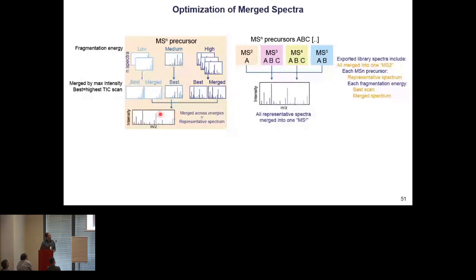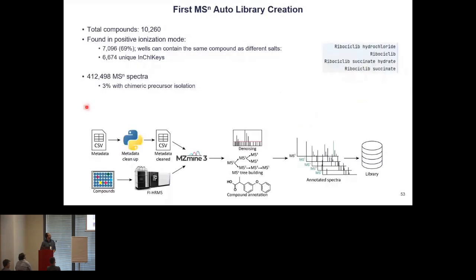And this is how it went in practice for the MCE library. The library came in plates, and each plate had 10 compounds in a well. So it was 3 plates in total. It only took 3 days to analyze on the mass spec with this method, because we are not using chromatography, so it's very fast. And we collected over 400,000 spectra.